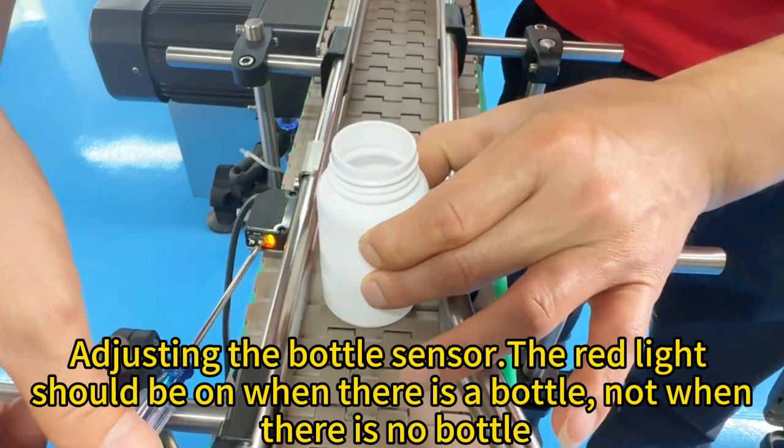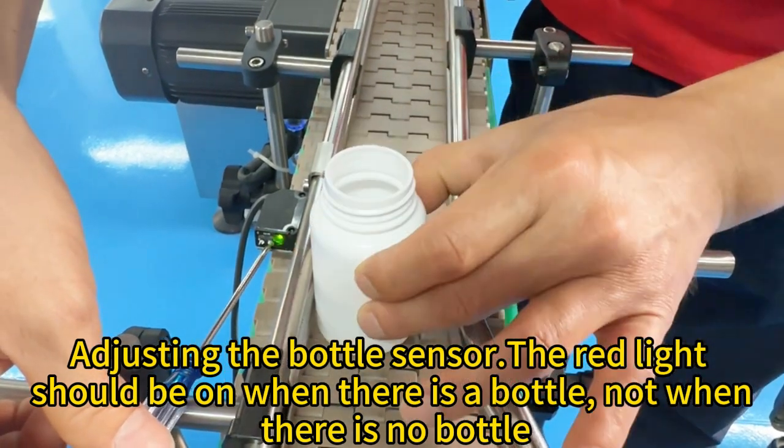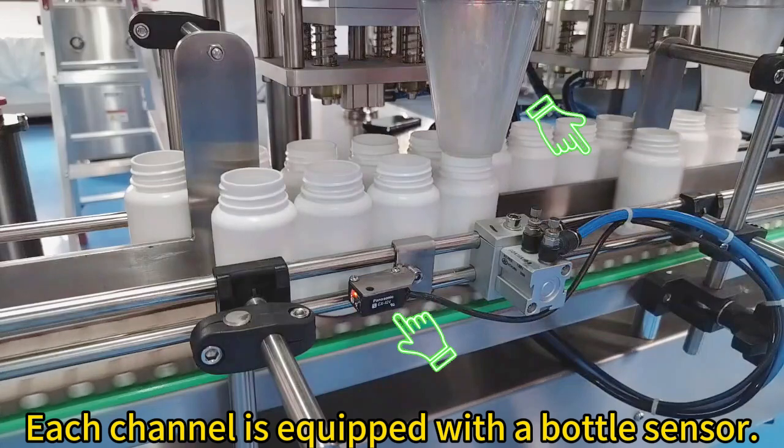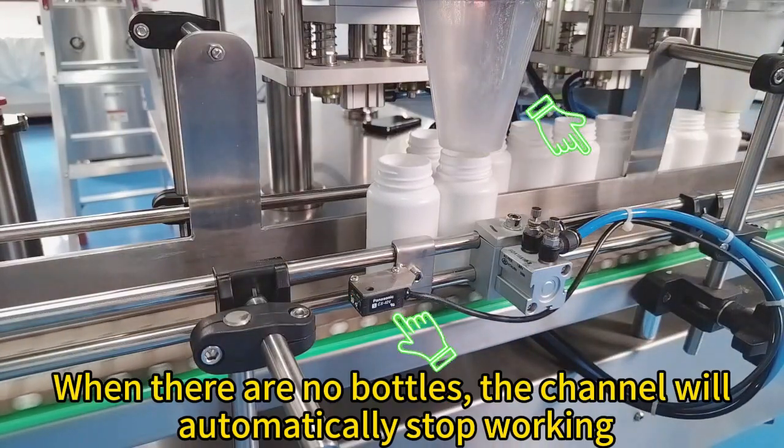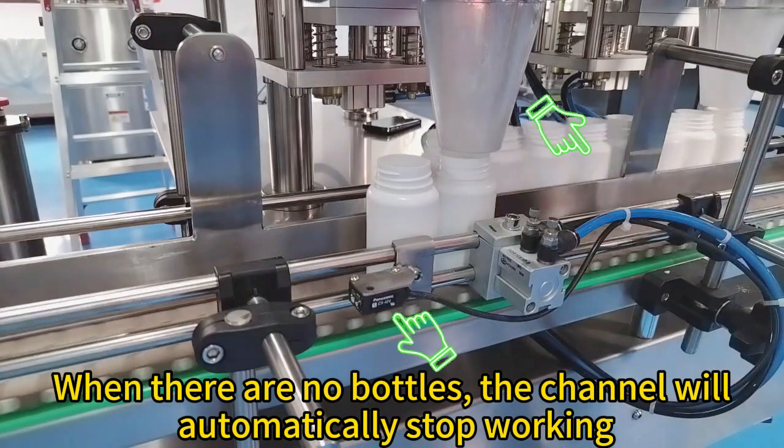Adjusting the bottle sensor: the red light should be on when there is a bottle, and off when there is no bottle. Each channel is equipped with a bottle sensor. When there are no bottles, the channel will automatically stop working.